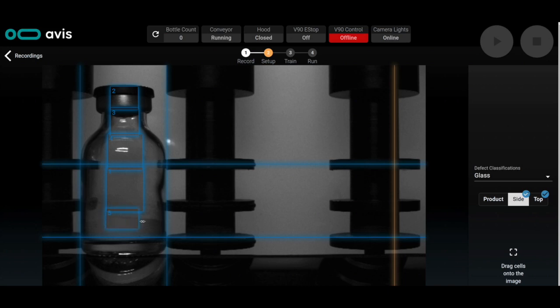This one down here is pretty common for us. We'll set an inspection area down here where the product is, or if there's liquid, and we'll set one right across the fill line. And this is one of the ways that the machine learning model can determine the normal fill level and all the different variations of that fill level. You may decide for a given vial type that you want to use the mirror and also inspect the base of the vial. I won't do that for this one.